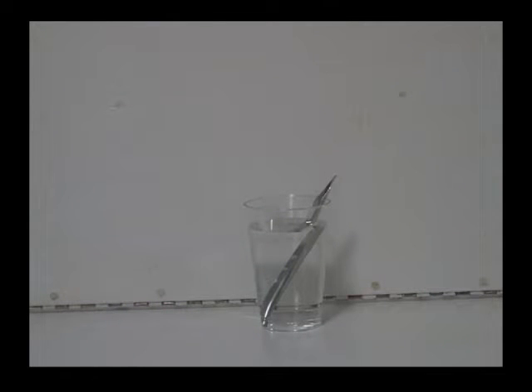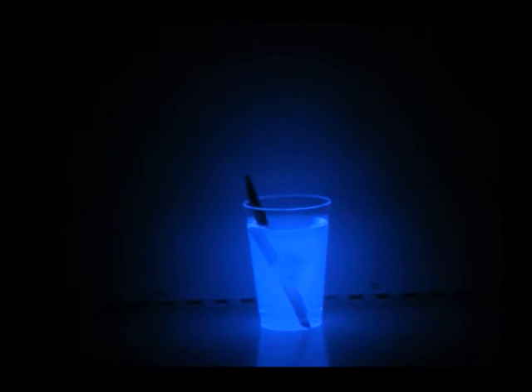There's the luminol solution. Lights please. One dim light for the stage hand to get back in place, turn off the dim light, add one drop of blood, stir. There's the chemiluminescence.